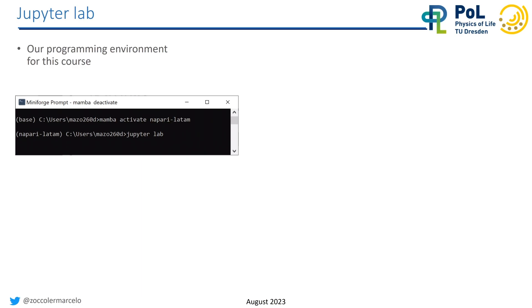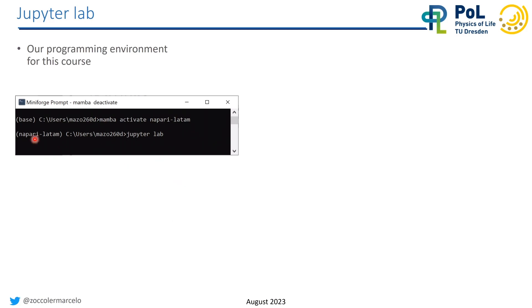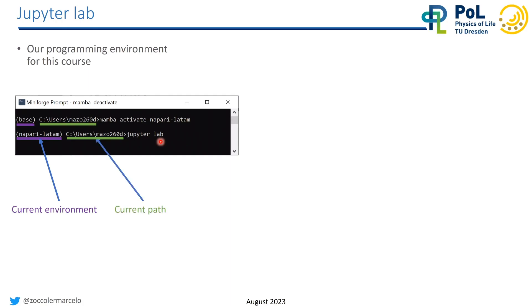You may start with the command prompt and then activate the environment we created for this course — later on you activate the environment you're using in your project. Then if you have the necessary packages installed, you just type 'jupyter lab' after activating, and this should open a new tab in your browser with JupyterLab. Pay attention that in the very beginning you have the current environment, usually followed by your current path. In my case I'm on Windows, so this is the path where I'm currently opening JupyterLab from.